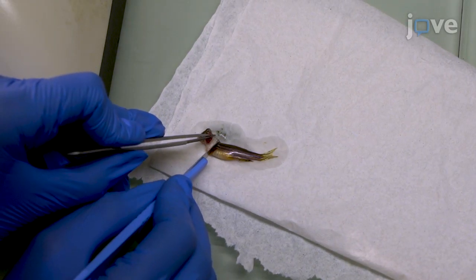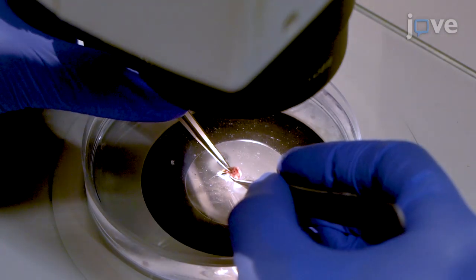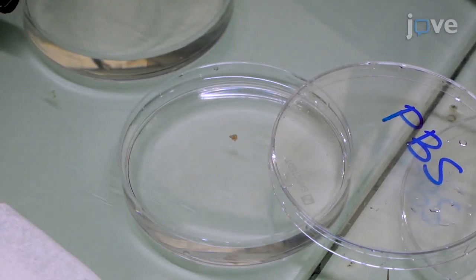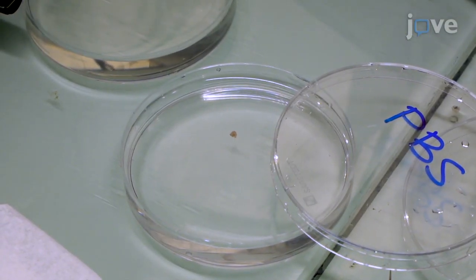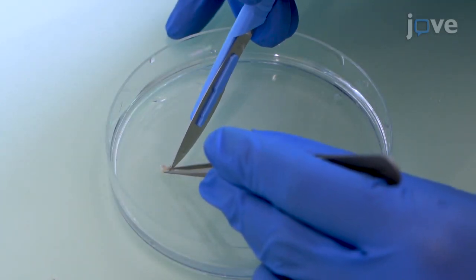Use forceps to gently break open the skull and remove soft tissues, skin, and bones from the ventral and dorsal sides of the skull. Then gently transfer the brain into a 30-millimeter dish containing ice-cold PBS, and mince the brain into small pieces using a razor blade.